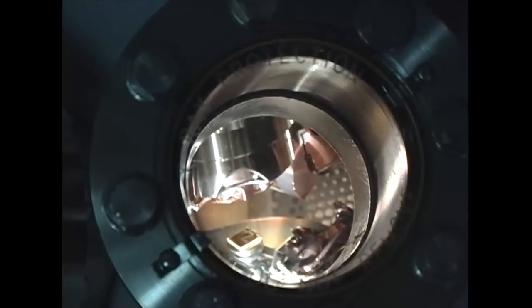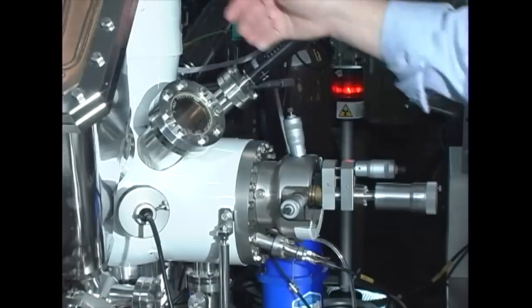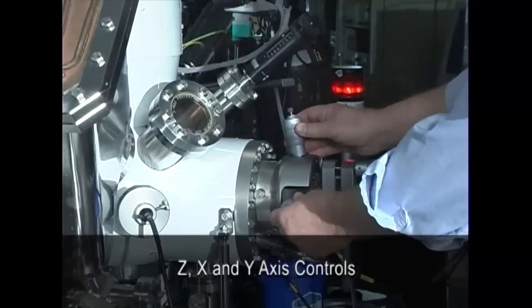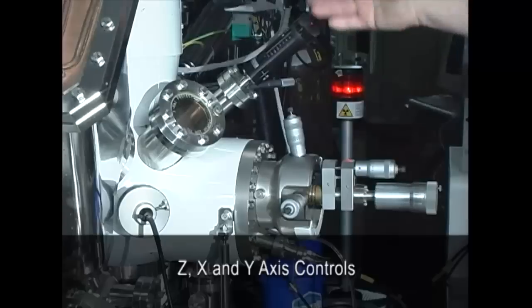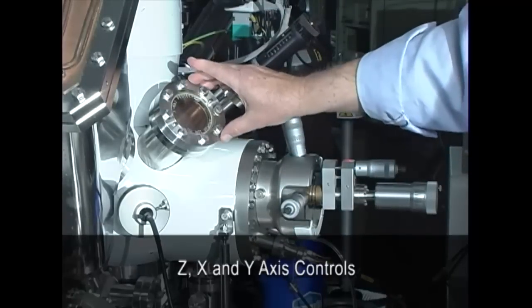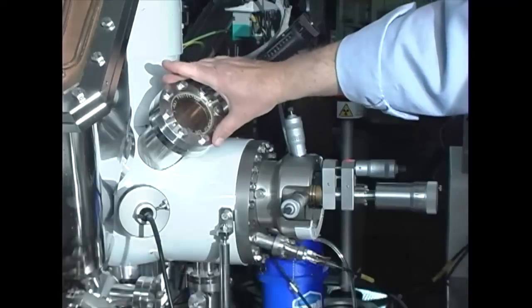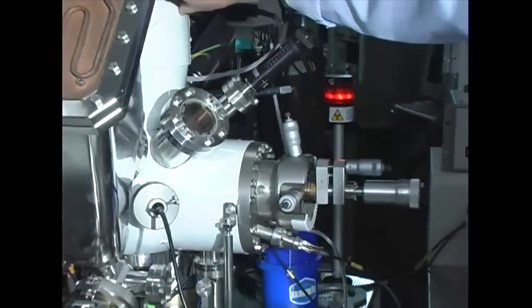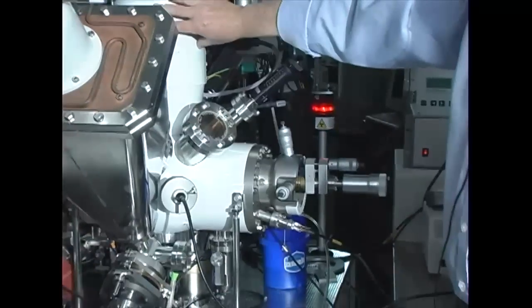So once the sample is in the position in the center of the analytical chamber, having been transferred off of this sample rod, we'll do some additional adjustments here of both the z-axis and the x and y-axis to make sure that we're in the appropriate position to collect the maximum flux of X-ray or UV photons, and then to collect the maximum amount of emission in the electrostatic lens.